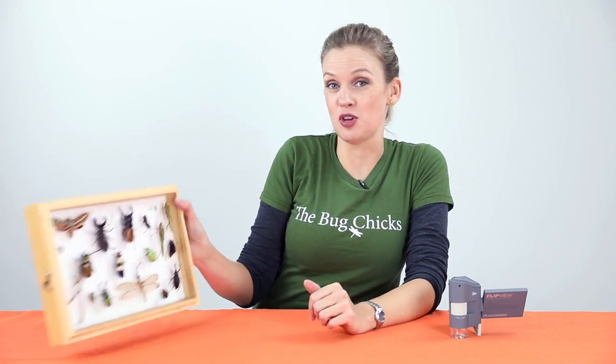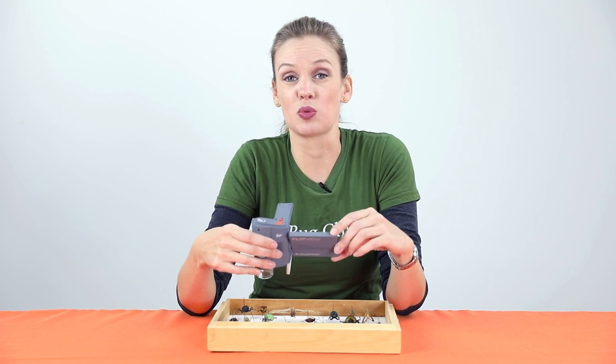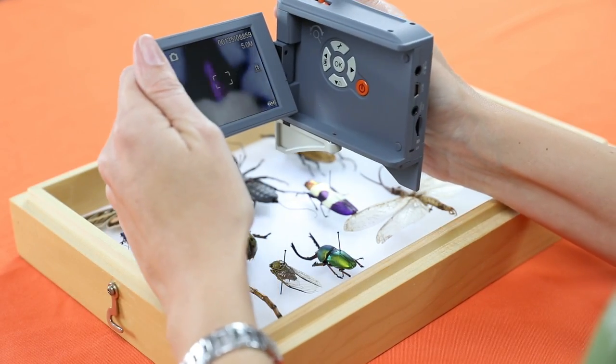What I love about the FlipView is that it's totally portable. You're not held back by wires or cords — it's got a rechargeable lithium-ion battery and it doesn't rely on Wi-Fi networks. So a kid can grab this and go outside and explore the world.